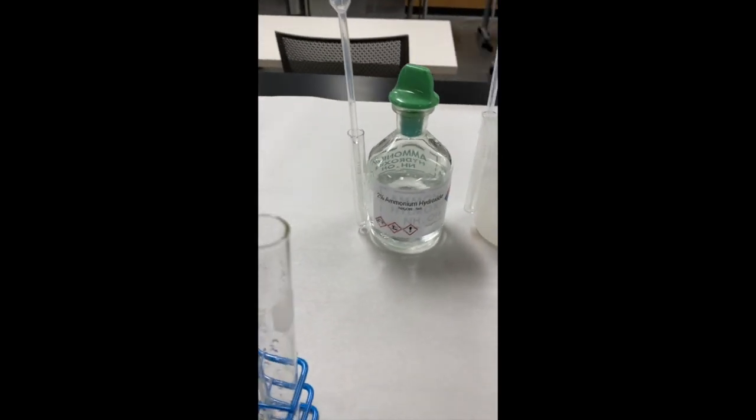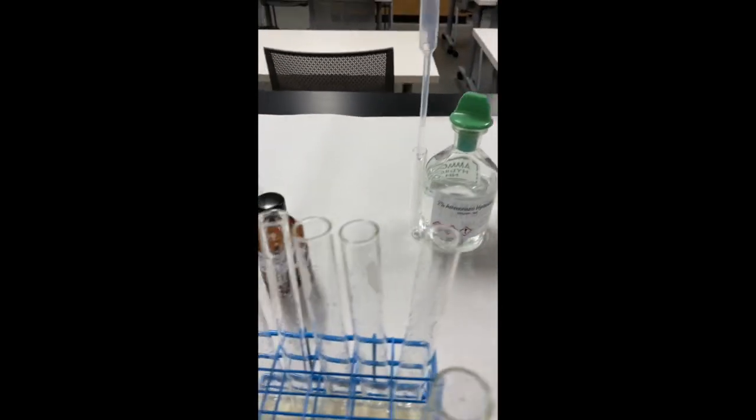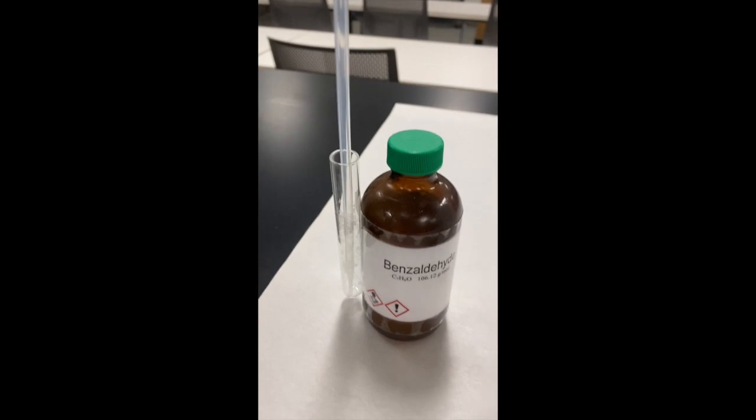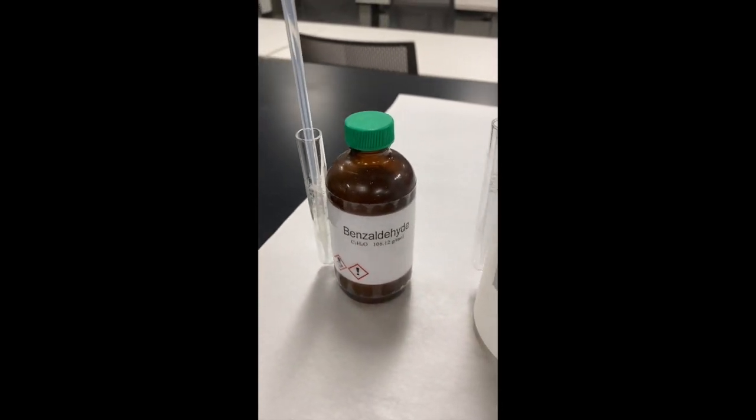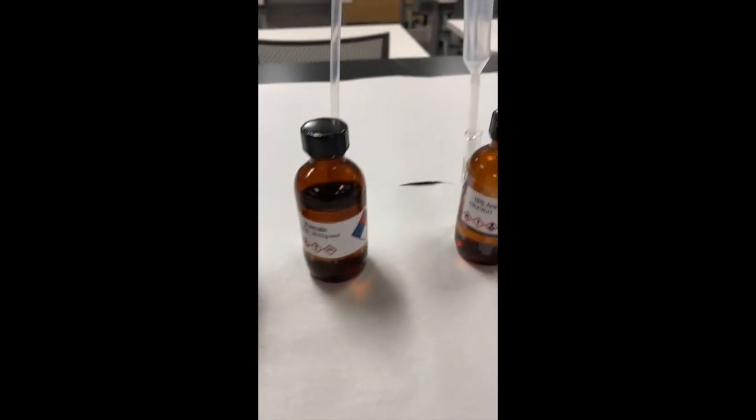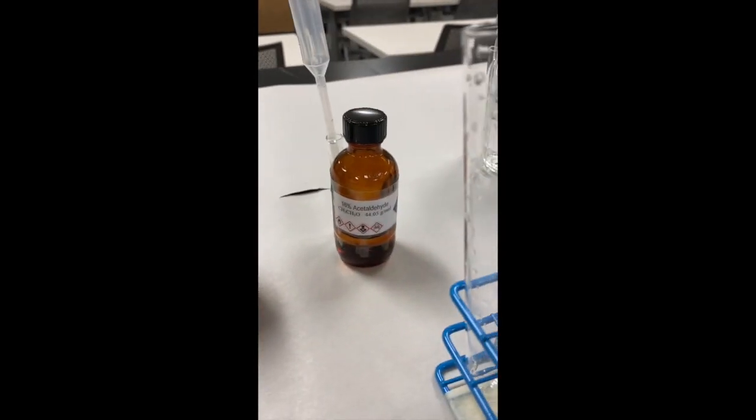I'm going to take that solution once I make it following the directions and disperse it into five test tubes equally. To the first test tube I'm going to add benzaldehyde, second acetone, third three pentanone, fourth formalin, and the last one acetaldehyde.